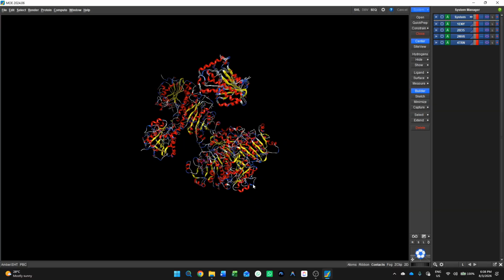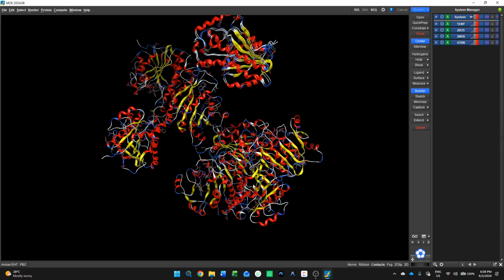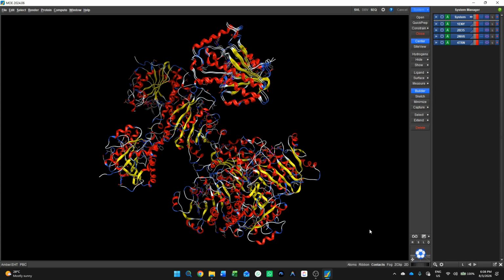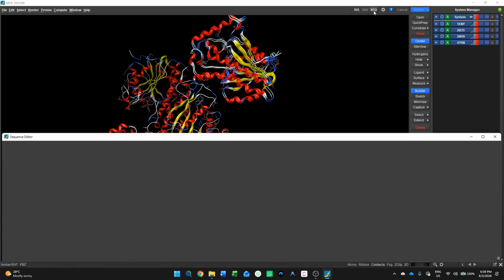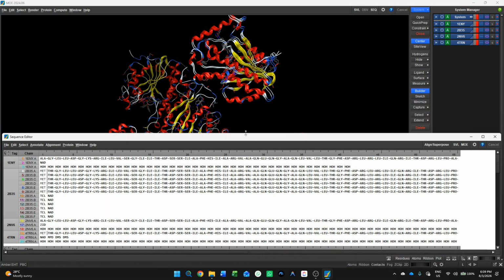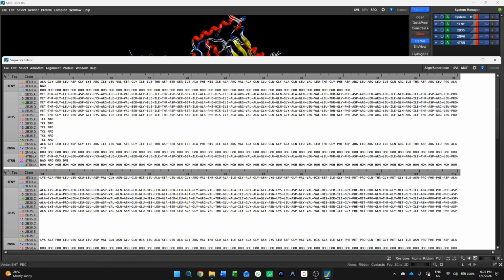For us to see the sequences, we can just click this SEQ up here. We have the sequences here.